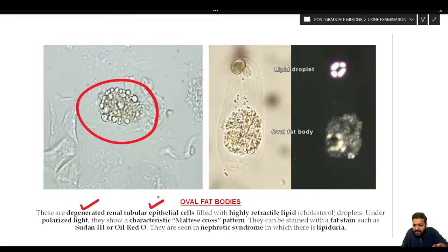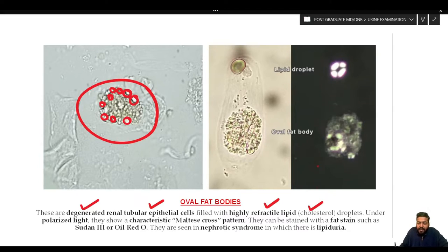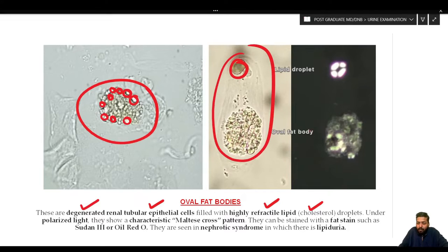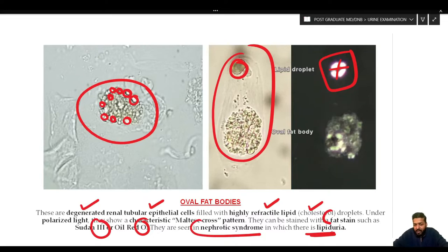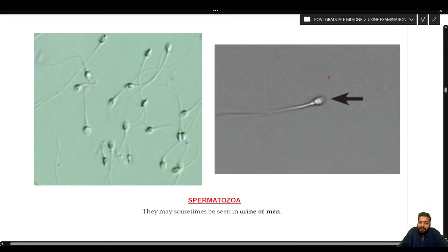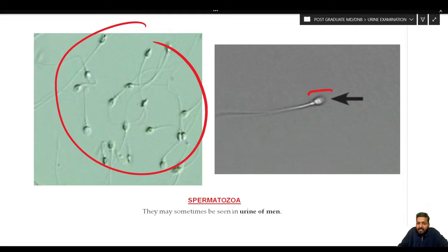Oval fat bodies are degenerated renal tubular epithelial cells that have become filled with highly refractile lipids or cholesterol droplets. Under polarized light, these fat droplets show a characteristic Maltese cross pattern. They can be stained with Sudan 3 or Oil Red O, and are mainly seen in nephrotic syndrome where there is lipiduria. Sperm may also occasionally be seen in the urine of men.